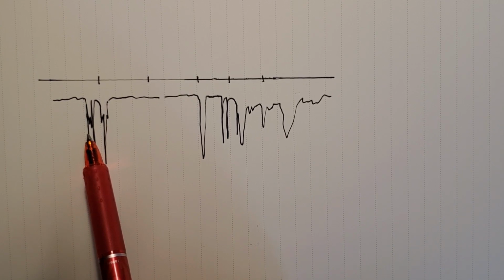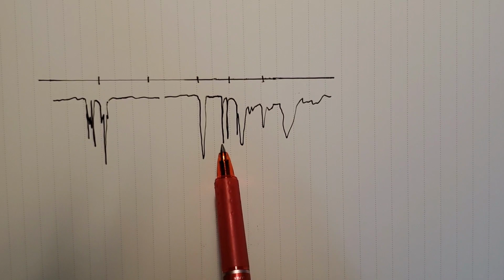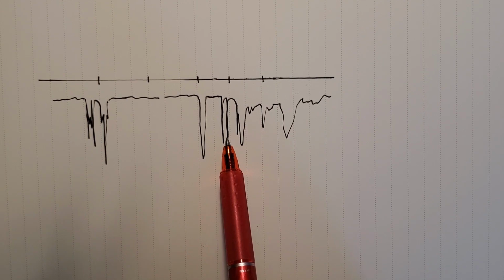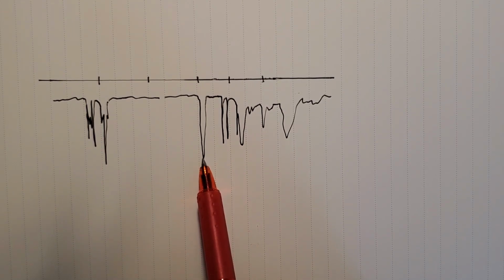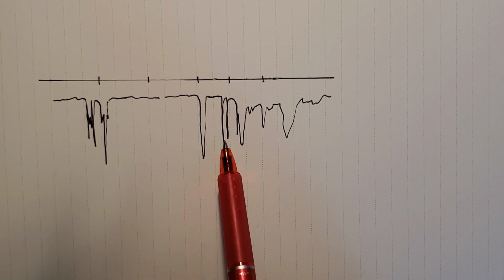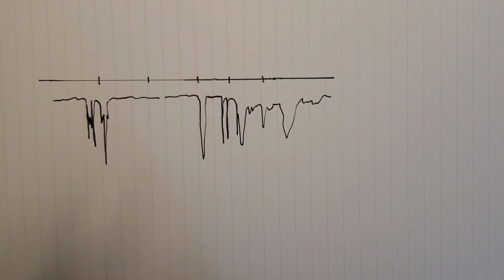And you check the sp2 area over 1450, you have a couple signals, but you still wonder, why is it so tall, almost as tall as a CO double bond? So something must be very polar. And then you notice, oh, this was as tall as well, so something is conjugated, or some electronegative group is nearby.